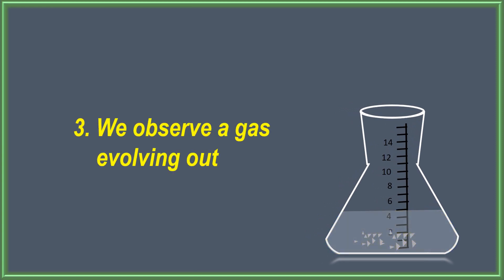We observe a gas evolving out. The gas is nothing but hydrogen gas, H2 gas.